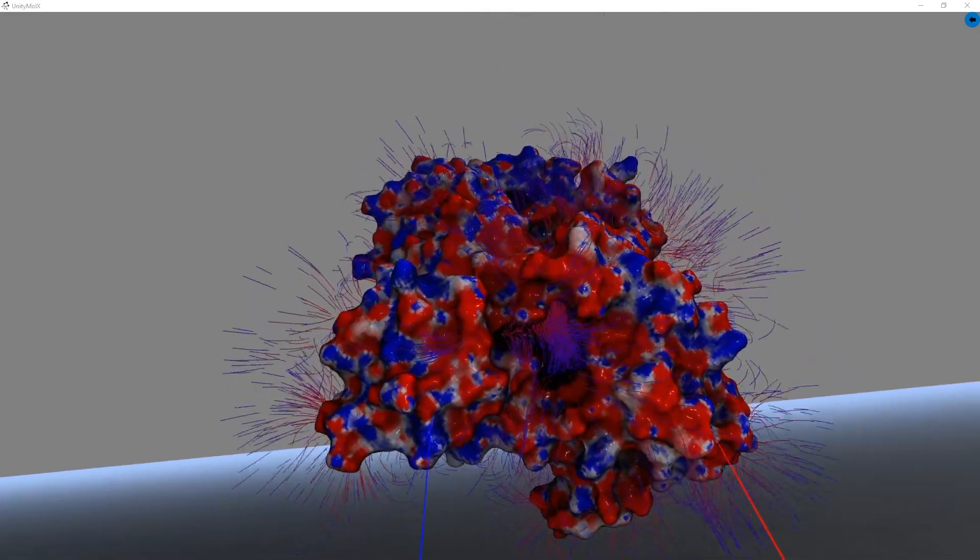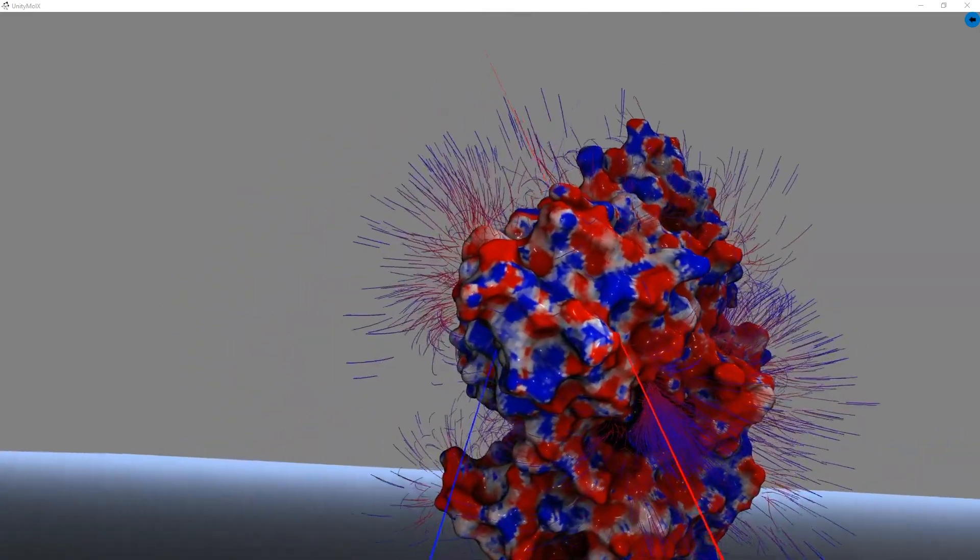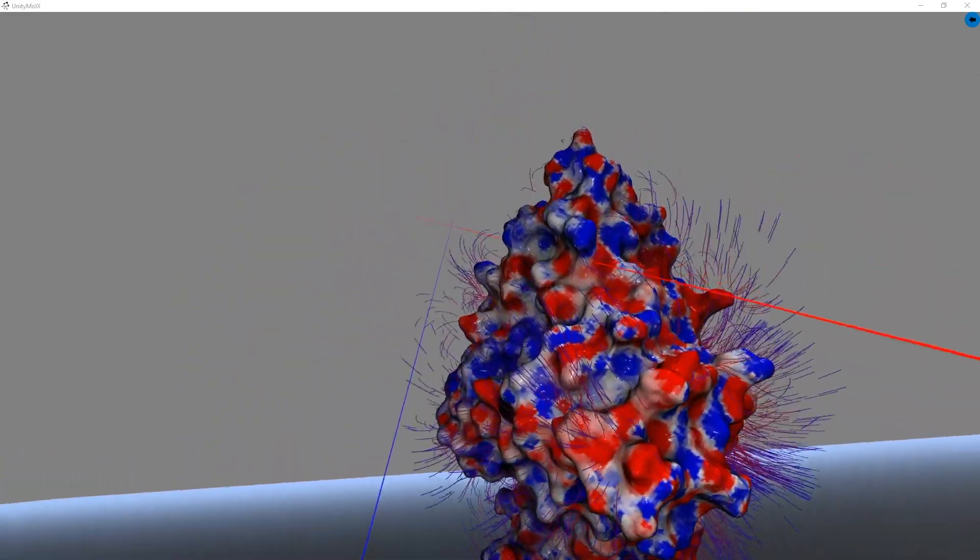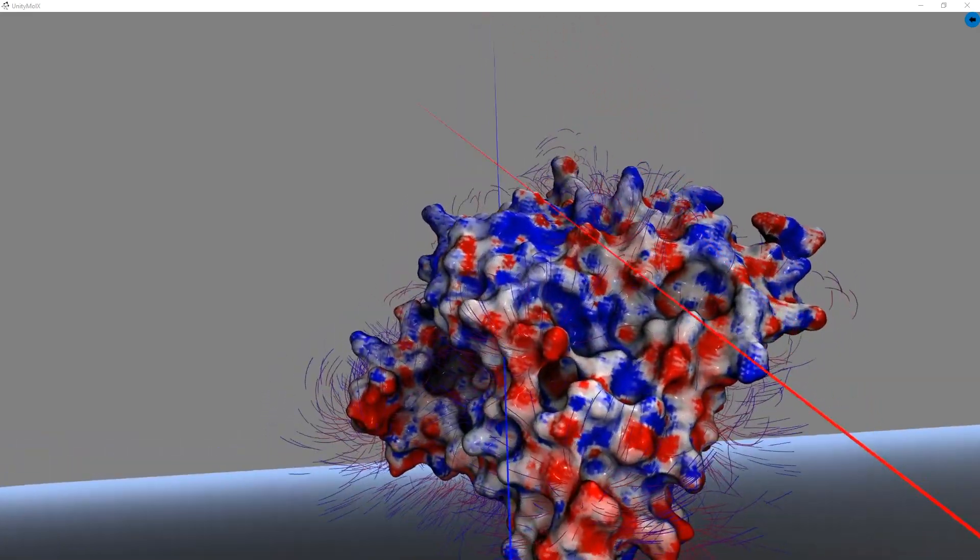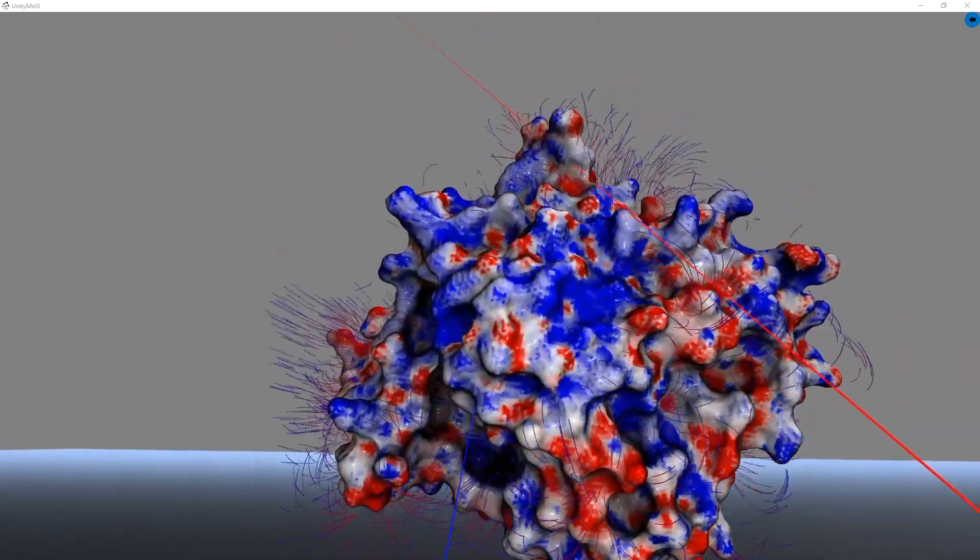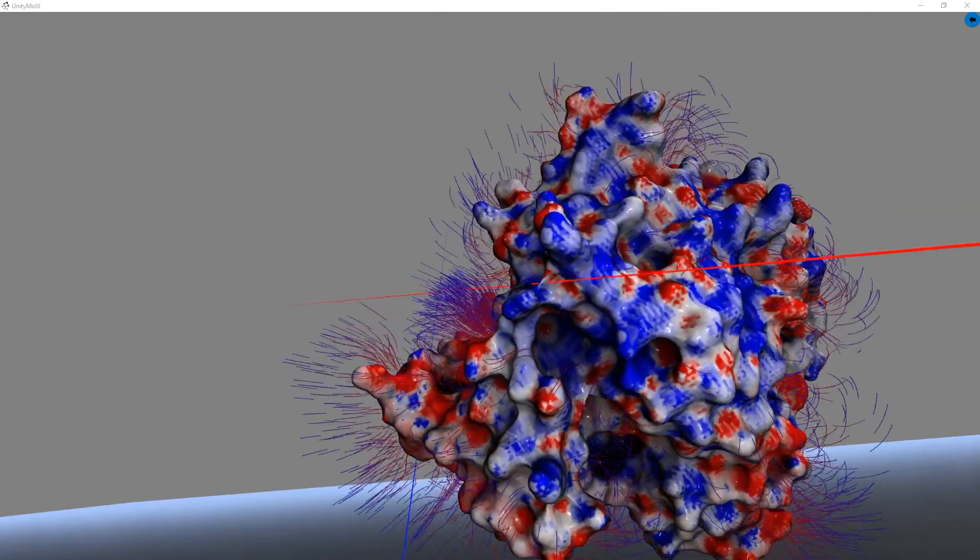The output file from APBS is a DX file, which UnityMole can then read to calculate and color the surface by the electrostatic potential, and also to calculate the electrostatic field lines.